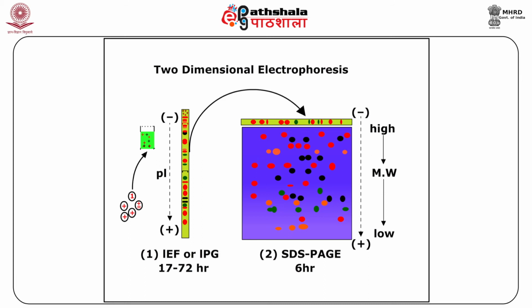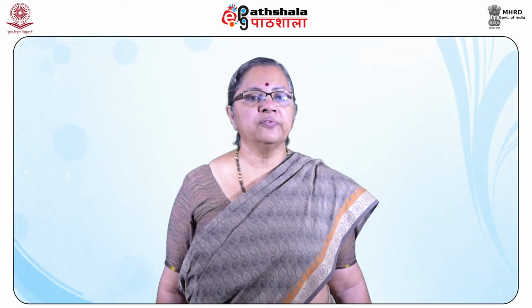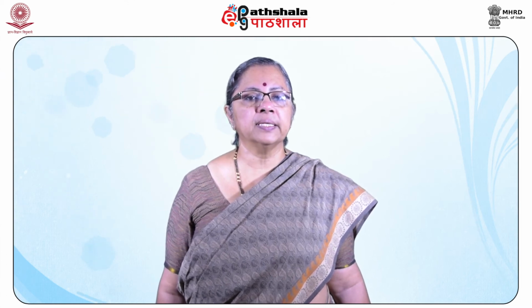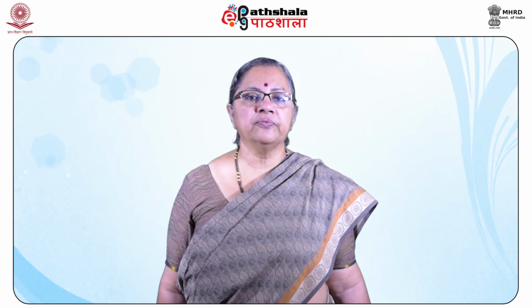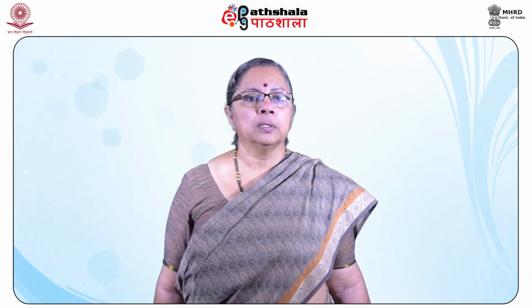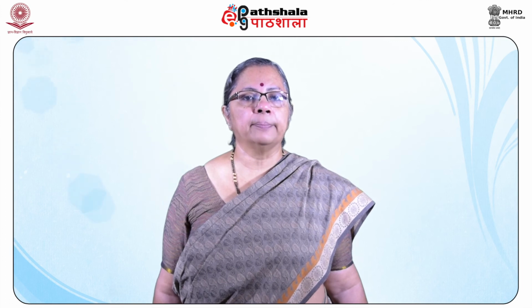It is known as two-dimensional because in the first dimension, proteins or peptides are separated based on their isoelectric point or pH. In the second dimension, they are separated based on their molecular weight. In the first step, proteins and polypeptides are extracted from cells under a given set of conditions and then separated from one another by their isoelectric pH in capillary tubes.